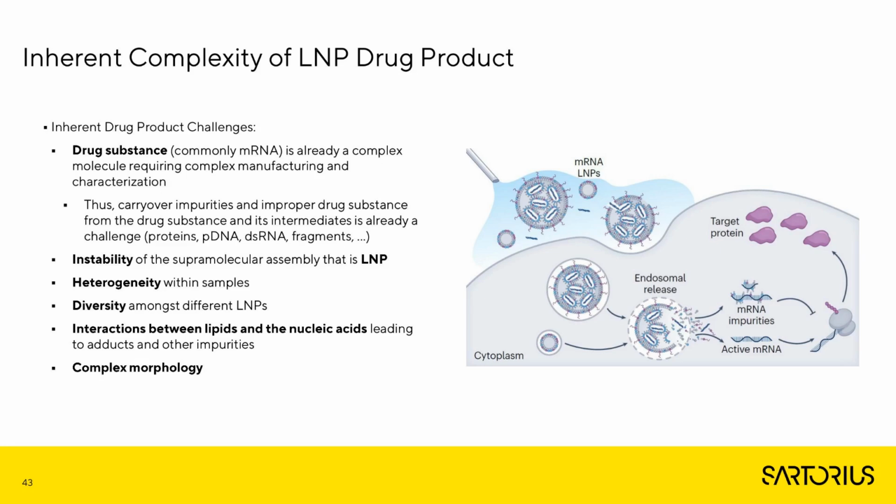But then you're introducing your excipients, which in this case are your lipids: in the case of LNPs, your ionizable lipids, cholesterol, phospholipids, and pegylated lipids. These are again new molecules that need to be controlled. Once you form this particle, you have a relatively unstable assembly, as it is only held together by intermolecular forces. You need to take care of this during manufacturing and stability, with different approaches to be able to control the stability.